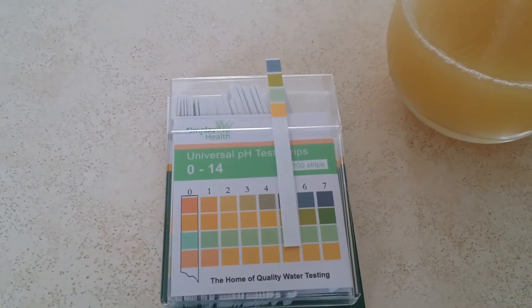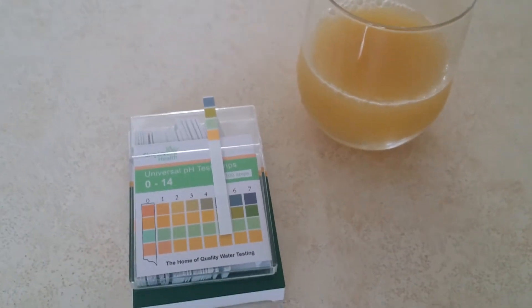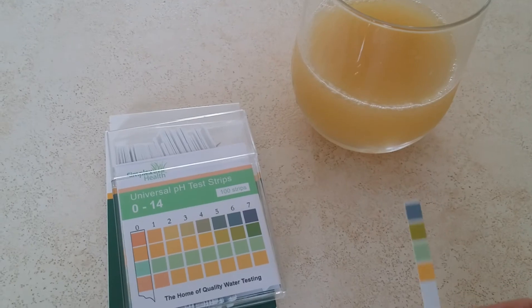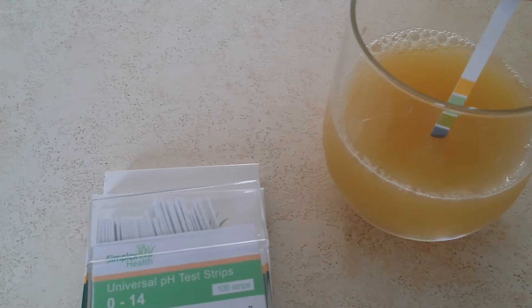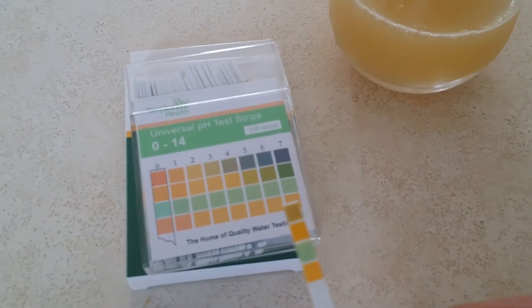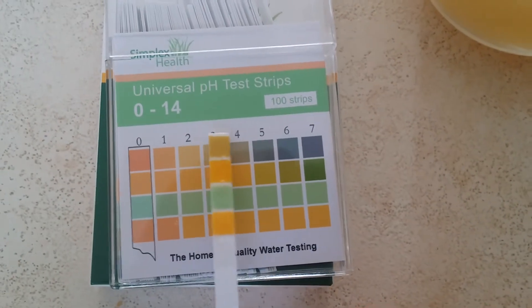I've got our test strips here, which is our Universal 0-14. So these ones you can use in pretty much any liquid you choose. So I'll get the strip — just there as you can see you've got a chart on the front 0-7 and then it continues on the back. So I'll put the strip into the apple juice, you just do it for just half a second, take it out then what we're going to do is match it against the chart here just to see what the pH is.